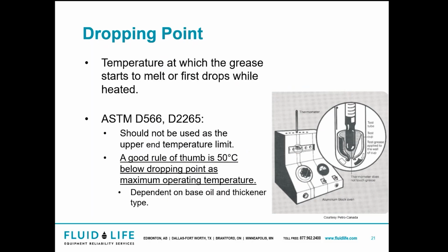And then dropping point. So remember I was talking earlier about the temperature at which the grease starts to melt or first drops while heated. So it should not be used as the upper end temperature limit for operating. You want to be about 50 degrees Celsius below. I believe I said 20 degrees Celsius earlier, but it is 50 degrees Celsius.